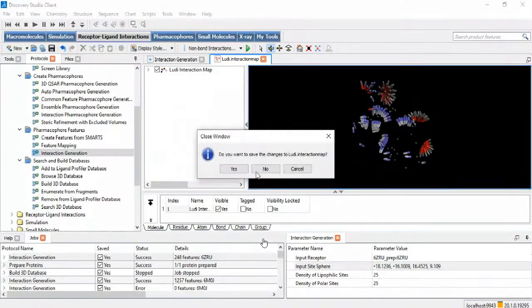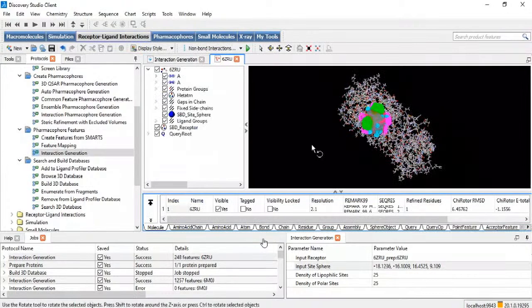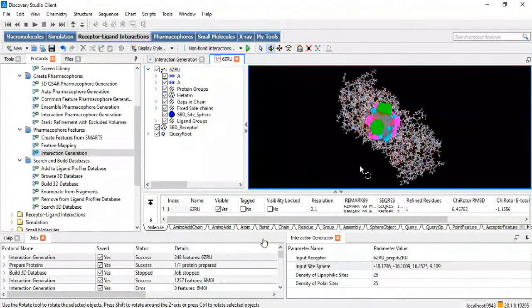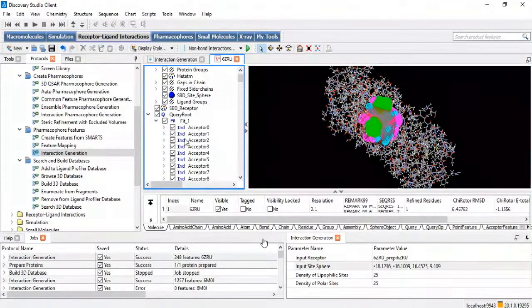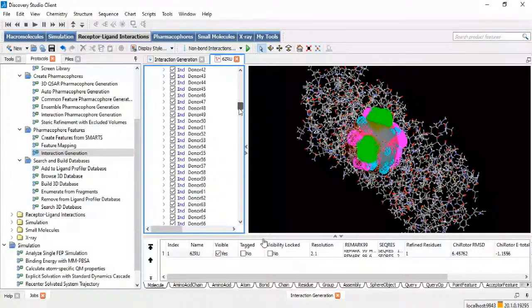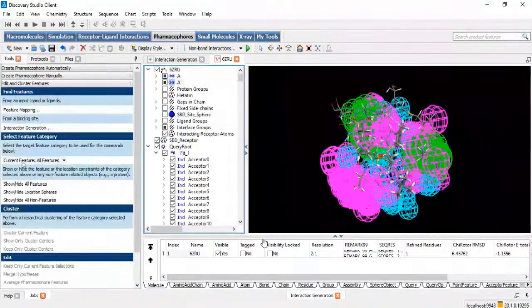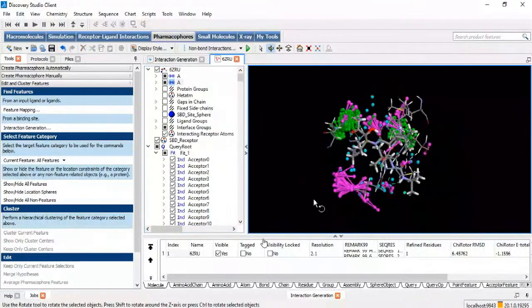You can see a lot of features have been generated in the protein active site. Zooming in, the query route is automatically updated. There are a lot of acceptors, a lot of donors, and hydrophobics. We need to select the appropriate ones using the edit and cluster pharmacophores technique. Select all features and hide the location spheres — this gives a view of what vector features and point features are present in your active site. Green is for acceptor, pink is for donor.